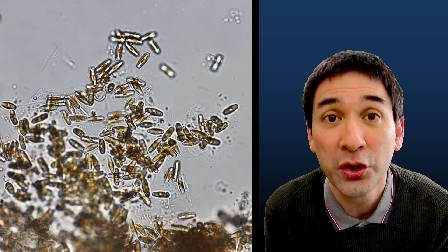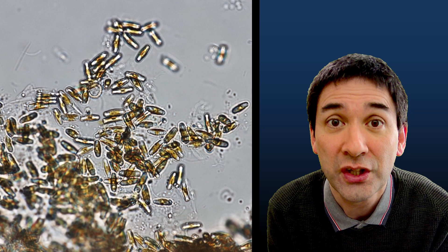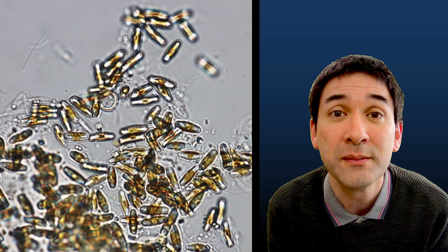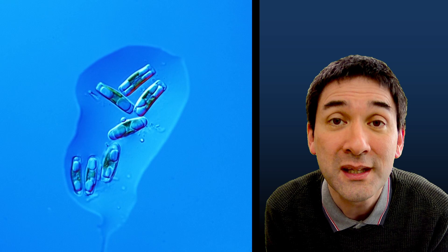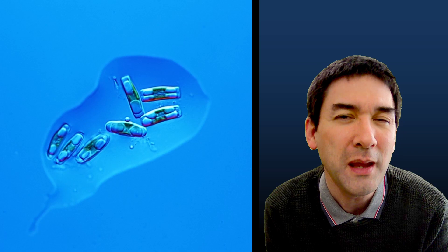Now, when I saw those, I was already very happy because this basically means that we have so-called producers in the container of the coffee machine. Producers are all those organisms that do photosynthesis. And when we have photosynthetic microorganisms in there, then this basically is the basis for a food chain. So maybe we're able to find some other microorganisms as well.